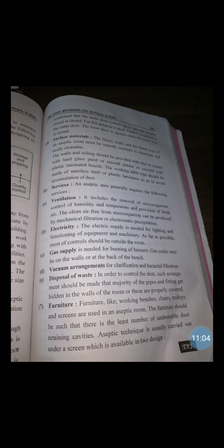It is important. The furniture should be such that there is the least number of undesirable dust retaining cavities.